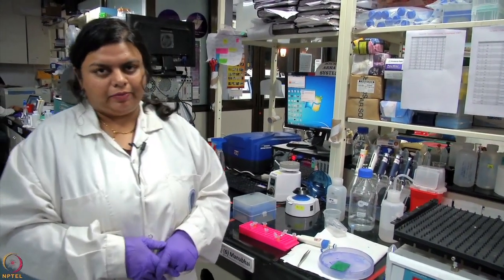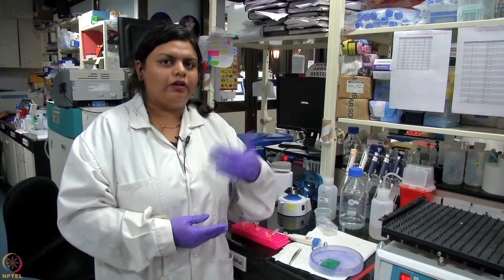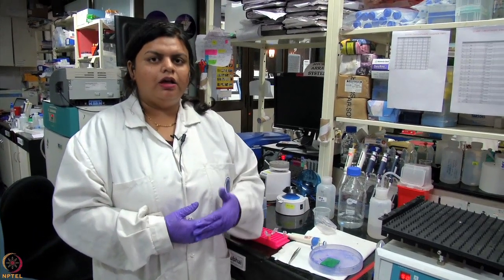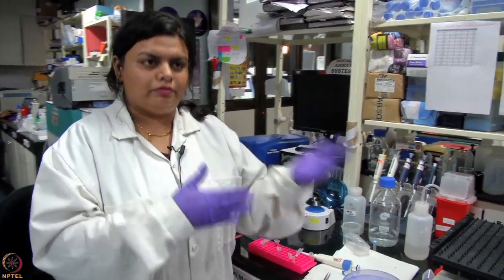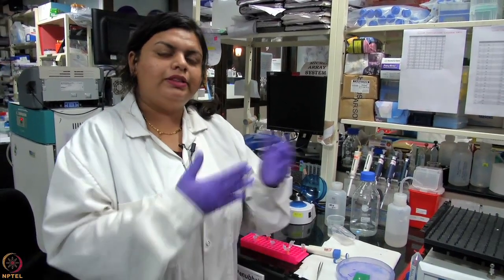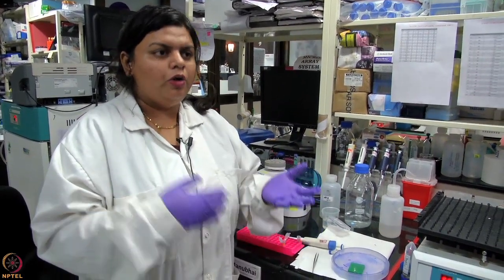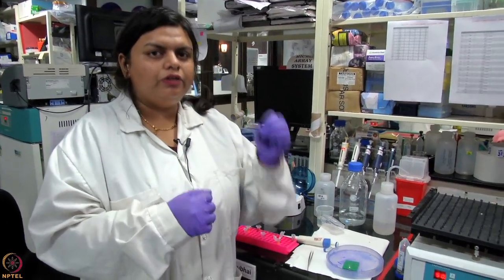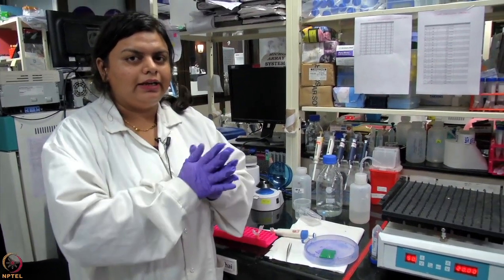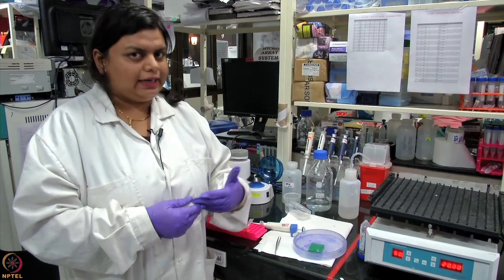To summarize our entire experiment, we have now performed immunoprecipitation of a protein of interest from mammalian cells. We have taken the cell lysate and pre-cleared it using beads, and in another section of it, we have conjugated an antibody specific to the protein with the bead. Then the antibody-bead conjugate was incubated with the lysate. The protein of interest gets captured by the antibody and all its interacting partners also bind to that protein, so that we can get a big complex, or a complexome, or the interactome that is present in the cell lysate.